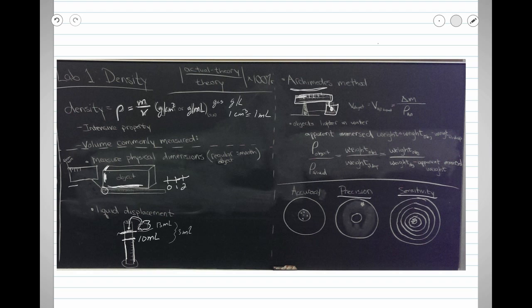This is because when an object is floating, it's going to displace a volume of liquid with a mass equal to the mass of the object, but our object is going to be submerged, which means it's going to displace a volume of liquid equal to the object's volume. So the apparent loss of mass, like I said, is equal to the mass of the liquid, in this case water, that is displaced. So in this experiment, we're going to do all 3 different ways.